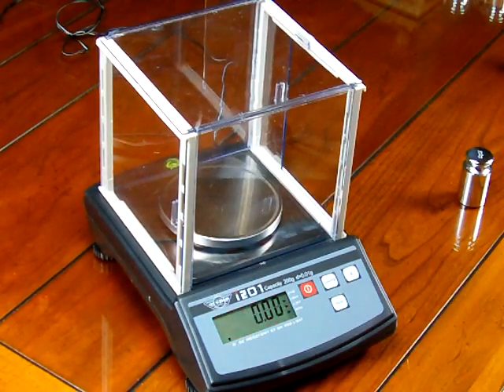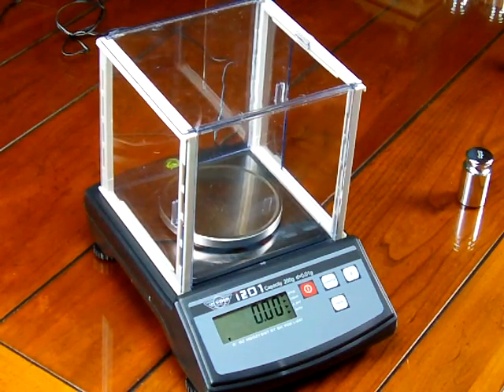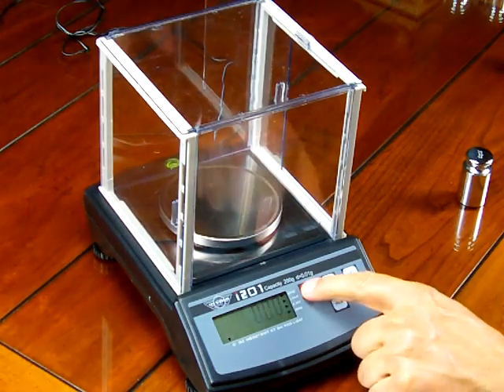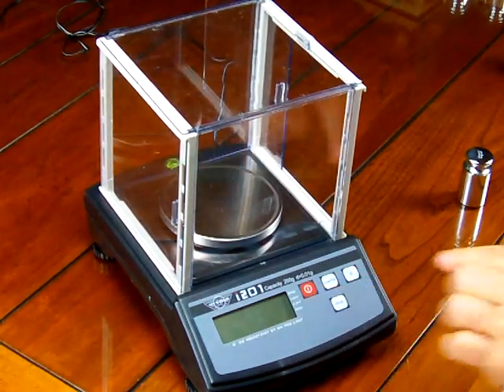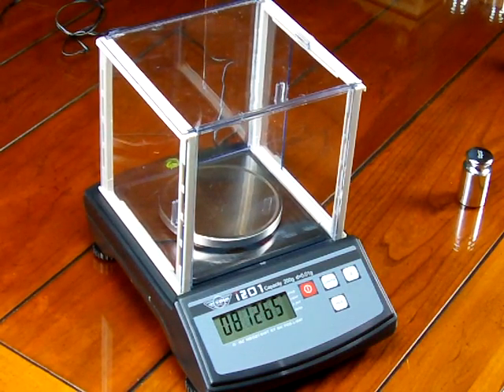Calibration is really simple. The scale should always be calibrated when it's first put into use. To perform a calibration, we want to shut off the balance, then press the zero key down, turn the on key, and release both.